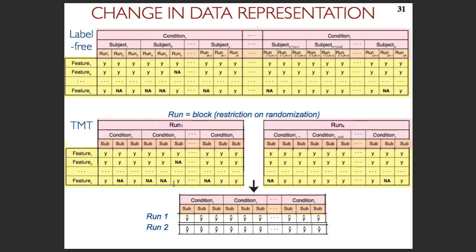So essentially, from this run, we will use the same approach, censoring and Tukey median polish, to account for outliers and missing values, to have one number per protein in this run. So it will be here. And then we will summarize this data structure. We'll have one number per protein in the second run. We will have run number 2 here.